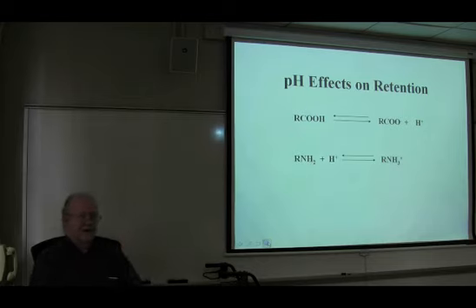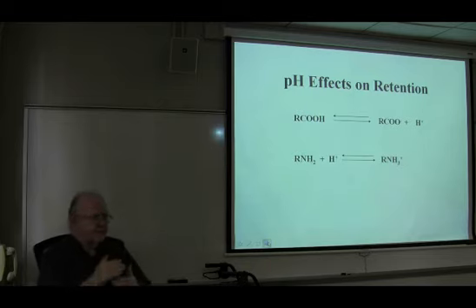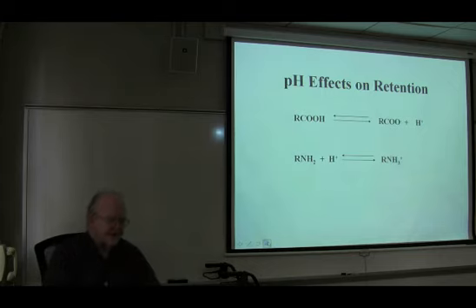If for instance we had a 10 millimolar pH 3 buffer and a 10 millimolar pH 5 buffer, there'd be no change in the retention of benzene or neutral compounds like that. If I change the buffer concentration, that's equivalent to changing the salt concentration, and we know that there's a slight effect of salt. We just talked about it.